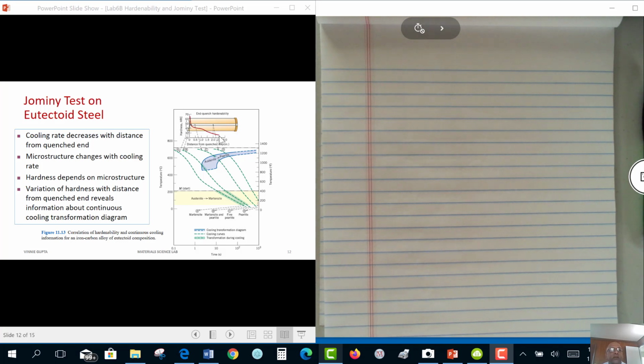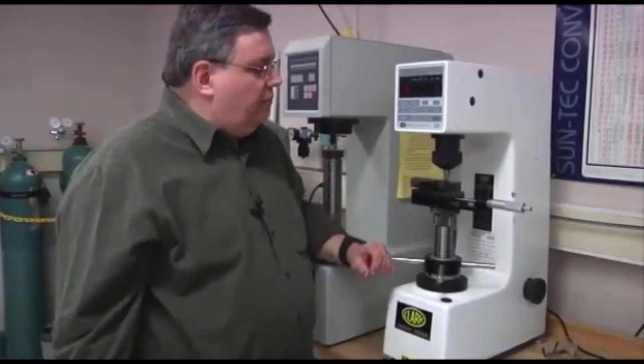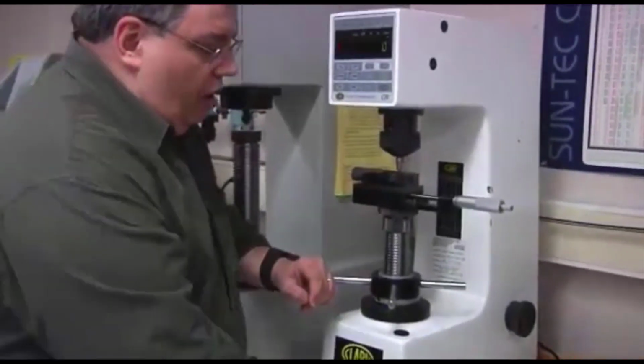So here is again Professor Humphrey making the measurements. Now he had a long video, and of course I'm going to cut it short instead of looking at all the measurements. Now we have our bar installed, the 0 point set. So this is the 1045 bar.